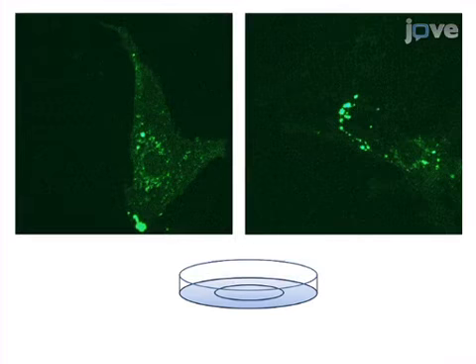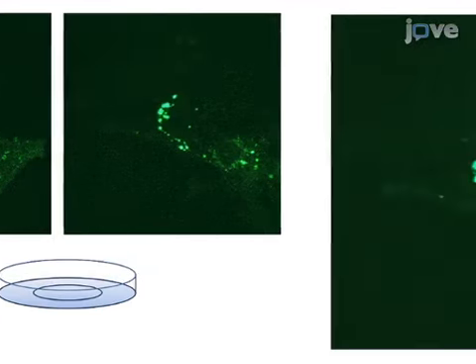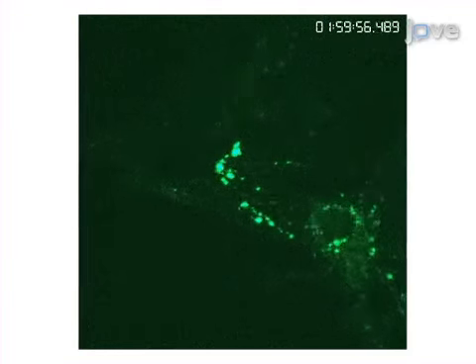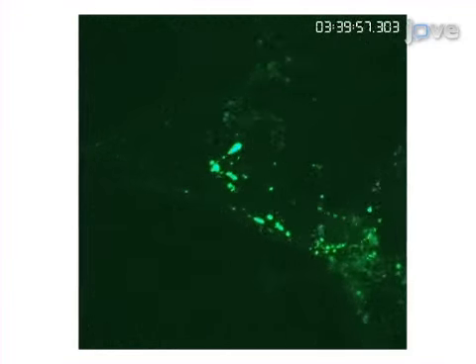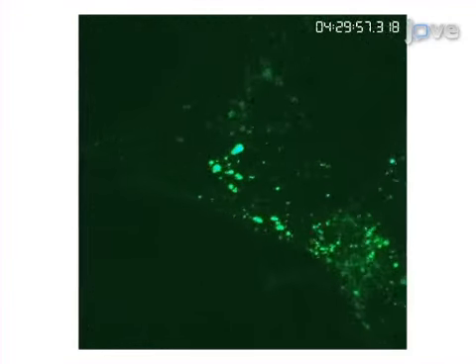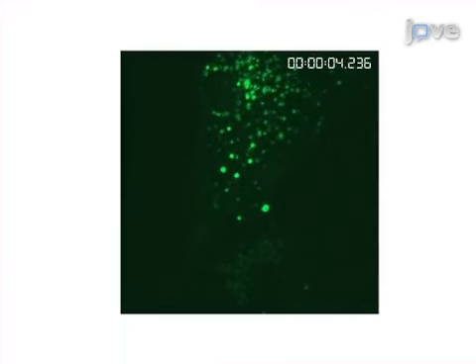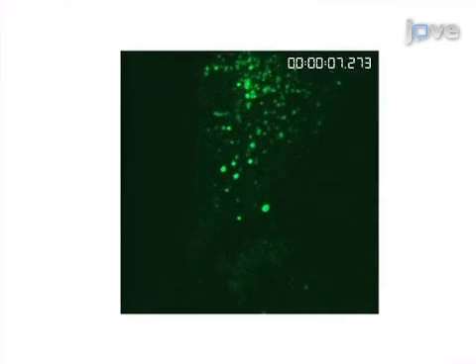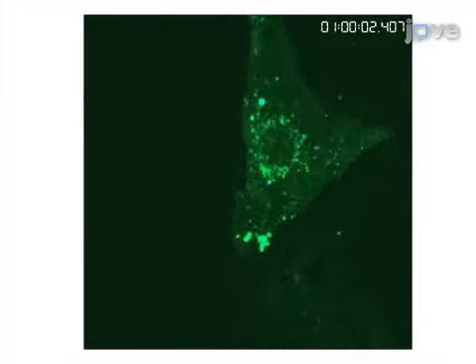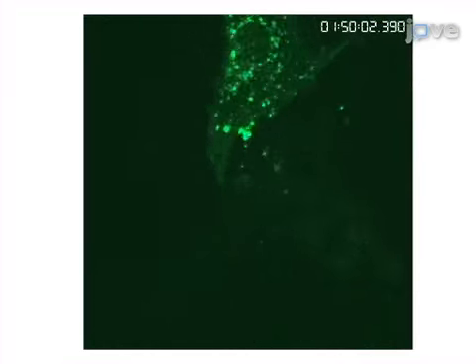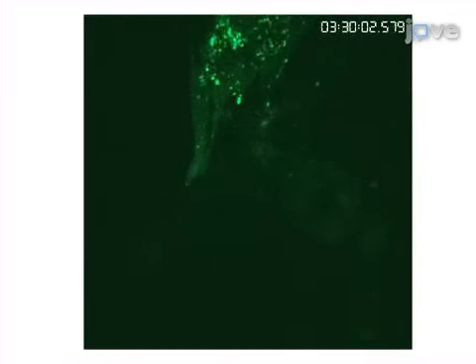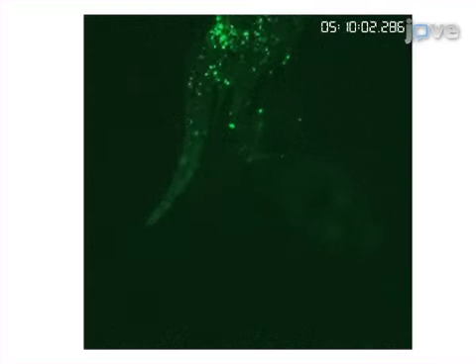The final step is to acquire time-lapse images using confocal spinning disc microscopy. Ultimately, a movie played back from acquired time-lapse images can be obtained that shows distribution of EGFP-tagged protein expressed by lentiviral genes in live primary cardiomyocytes under altered cell conditions by an adenoviral expressed protein, dominant negative FGFR1.